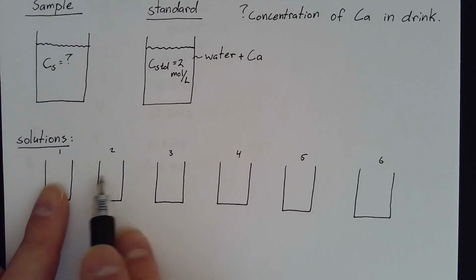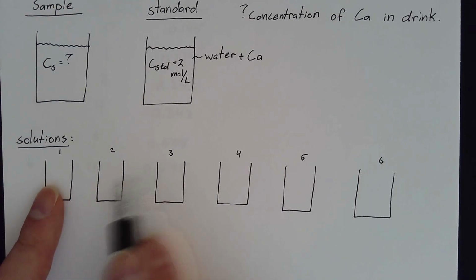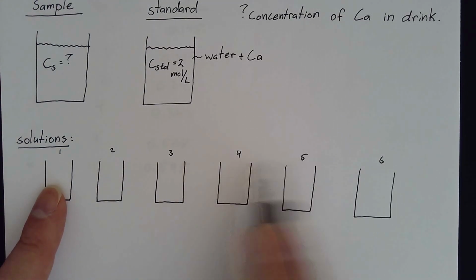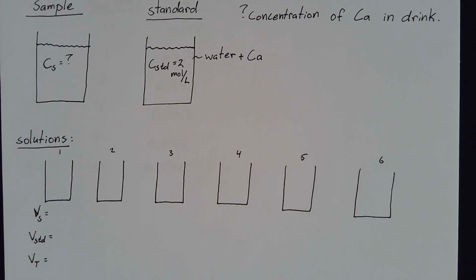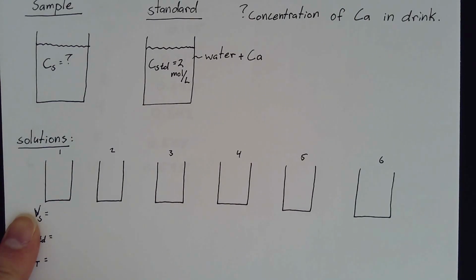So for instance, if you only do 2 solutions, adding in a third one is way better than 2. 4 is a lot better than 3. 5 is better than 4. 6 is better than 5. And 7 is, you know, it's better. Each one is better. You get the idea.